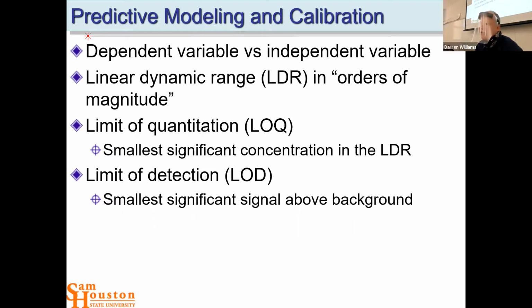It's just a nice rule of thumb. It's like 3 sigma, right? So if your background gives you 1,000 counts between these 2 limits, even though there's no peak there, you'd have to have a peak that gave you an overall value of 3,000, 3 times your background, before you can say, all right, that's a real peak. That's a significant signal. You might not be able to quantify it with like 95% confidence, but you could say there's a significant signal there.